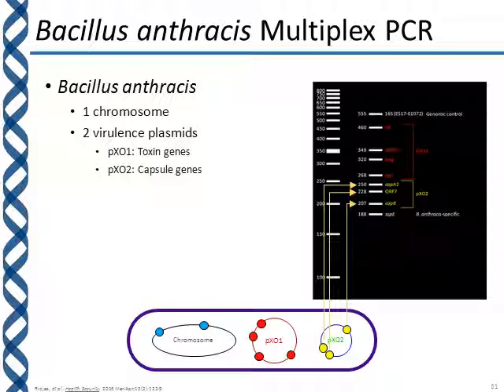And I used a lot of the techniques that we discussed in terms of primer design and changing annealing temperatures and so on. And so there's a lot of work in particular that goes into designing a multiplex PCR, because if you change one of the amplicon sizes, it may get too close to one of the other amplicons to be able to differentiate on a gel. And so there's a lot that goes into this, and I personally think it turned out pretty well.